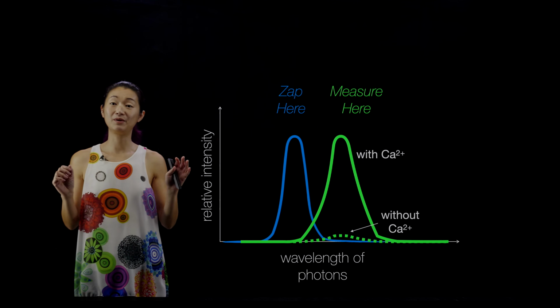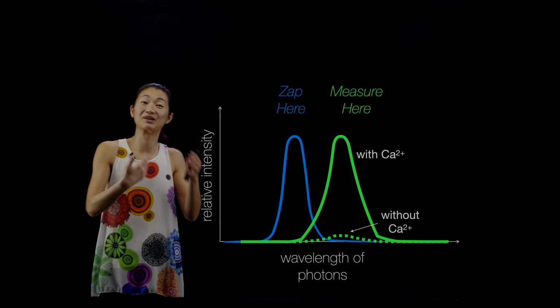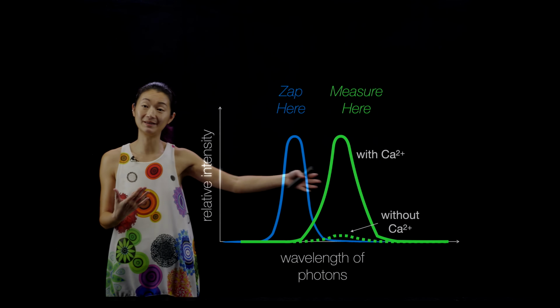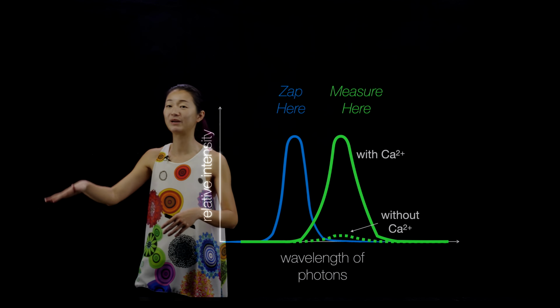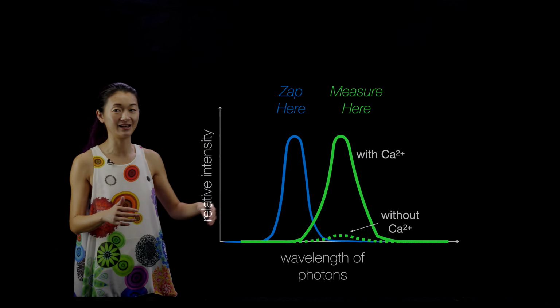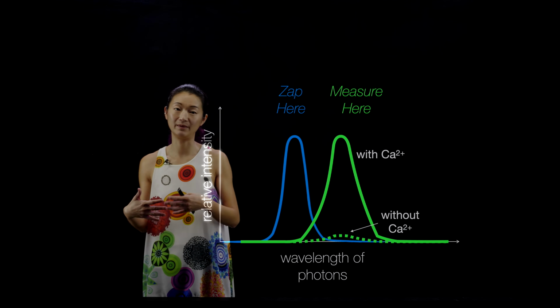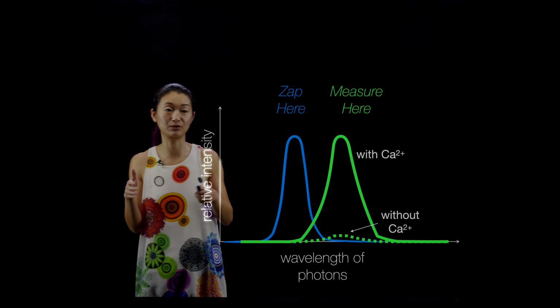Now, I told you that people have been engineering GCaMP for a long time. There's now, I think, up to 7 different iterative generations of GCaMP that keep getting better and brighter and faster. There's also different versions of GCaMP that are made with different colors, so you can actually have multiple ones in the same experiment, right? So if you have one set of GCaMP in one subpopulation of neurons, let's say the glutamate neurons, they emit in green, and then you have another population that is the GABA neurons, and they emit in far infrared or something. You can actually simultaneously image the neural activity of different subpopulations of neurons in the same experiment by having them be separated by different types of GCaMP so that they can be separated in spectral space as well.